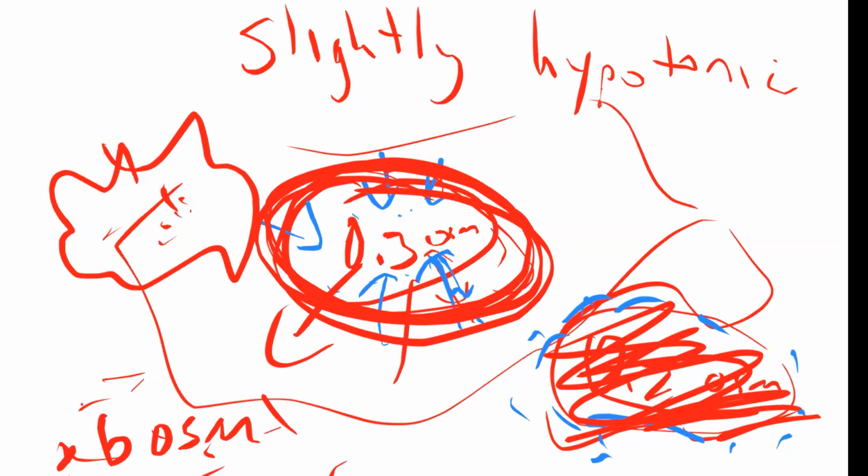Where do you draw the line on crenation versus the smaller gradients we talked about earlier? With 0.6 osmolar versus 0.3, the higher gradient versus the smaller gradient, where is that line drawn?